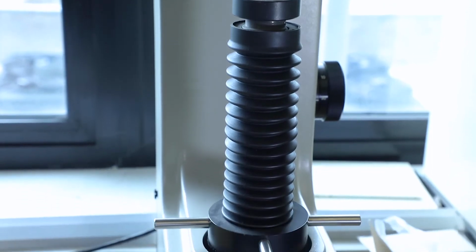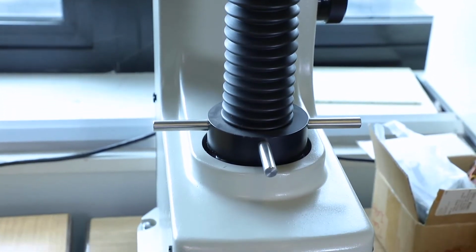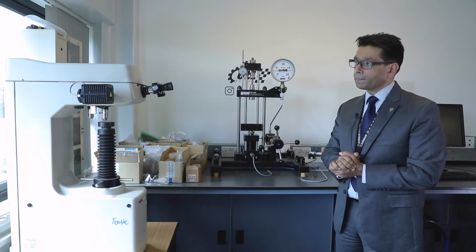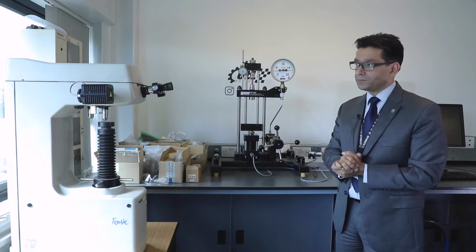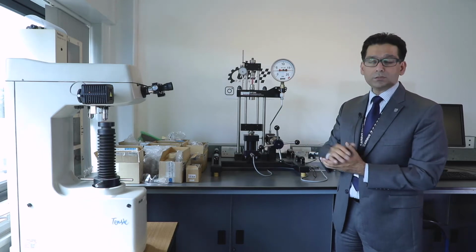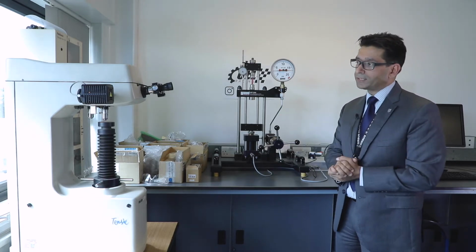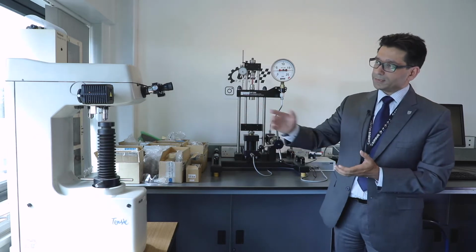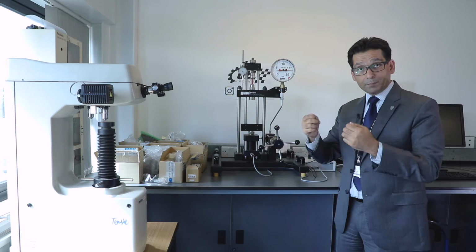So the principle is straightforward. With the help of technicians downstairs in the general engineering workshop, they achieve a mirror polished surface. We have the grinding machine, we have the polishing machine. Once they mount the sample in a plastic casing, and once it's fully polished, they let the machine create a diamond indent.